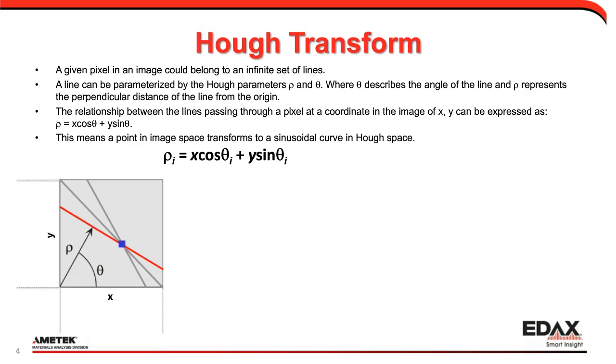The Hough Transform is kind of a weird feature where we started using it when we originally started doing EBSD live and automated in the mid-90s, and it just worked. We optimized it for our work over the years and it does a really good job.